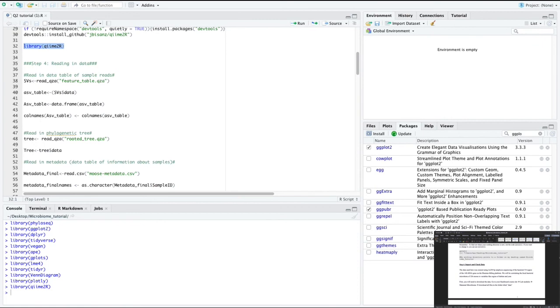Okay, and so next we're going to import and check our data. I talked about this. This is just background on where the data comes from. It's fecal bacterial microbe data. We're looking at variables like region and year. And again, this is where you're getting your data from the Blackboard course site.